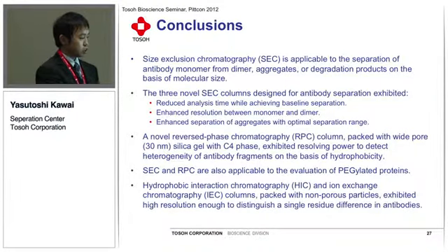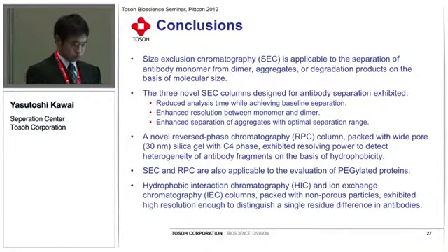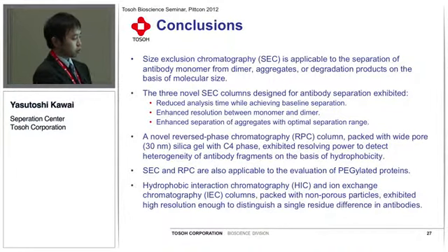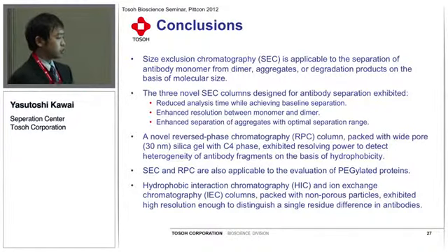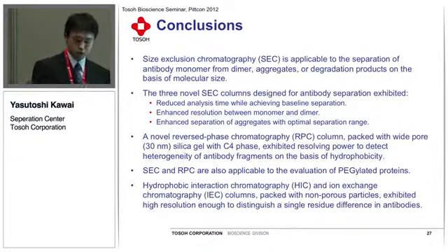SEC and RPC are also applicable to the evaluation of PEGylated protein. In addition, we have seen that hydrophobic interaction chromatography and the ion exchange chromatography column packed with non-porous particles exhibited high resolution enough to distinguish a single residue difference in antibodies.